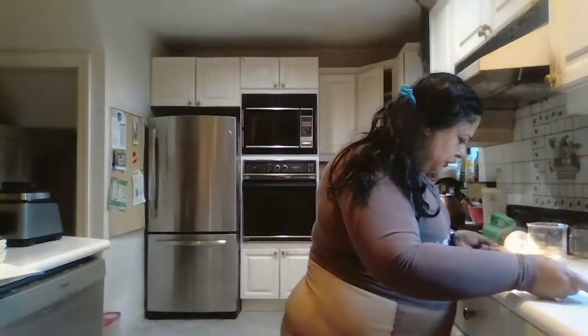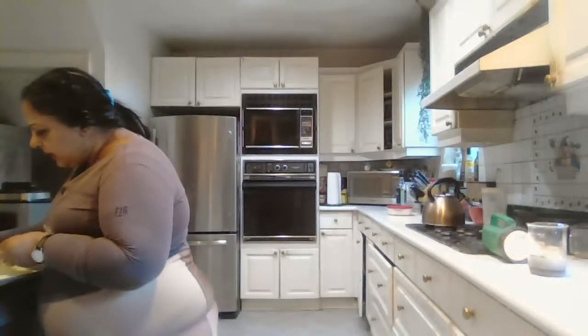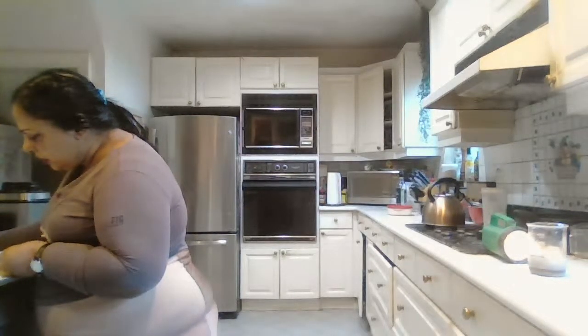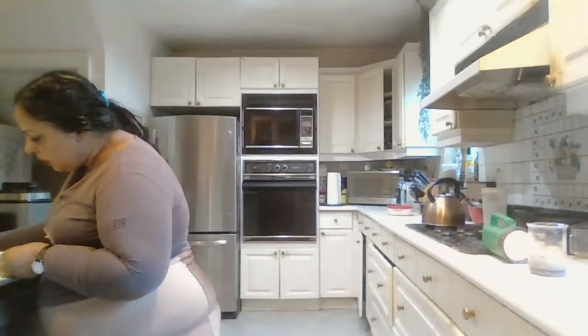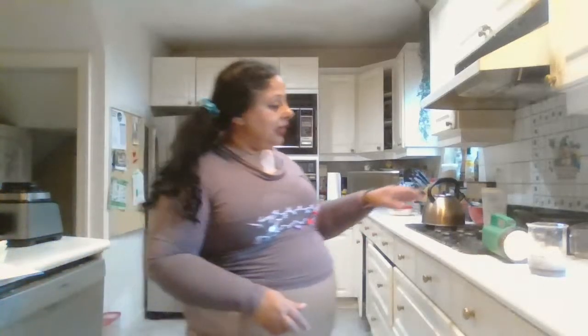So it's close to 5 inches. Path of light, it should be in centimeters. Close to the center of the beaker. 10 inches. So I'll let you have all the fun in the world measuring.